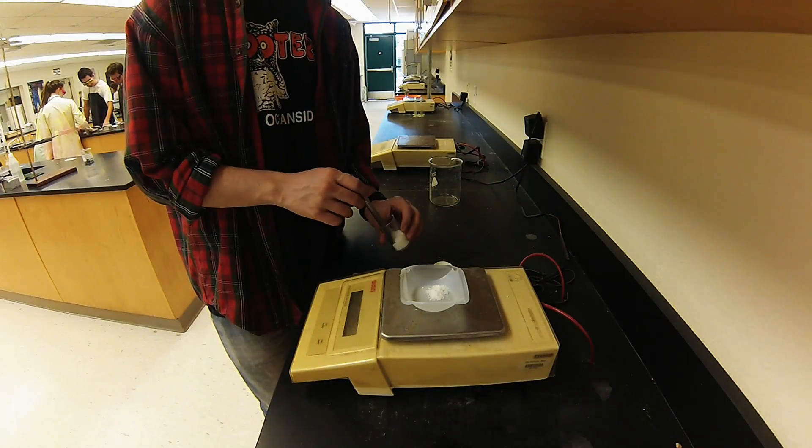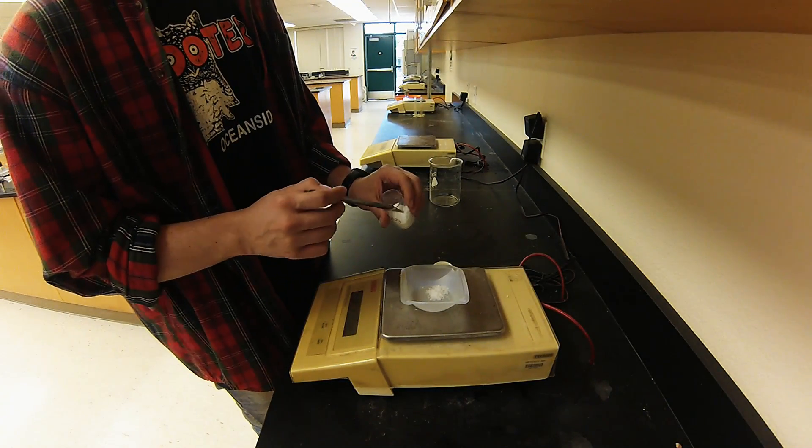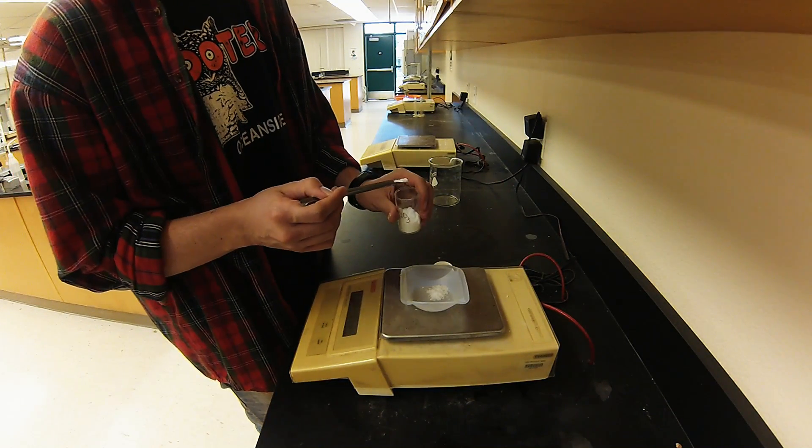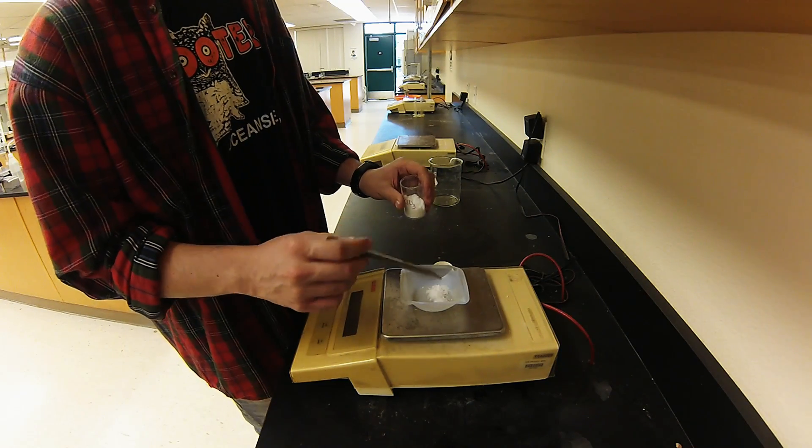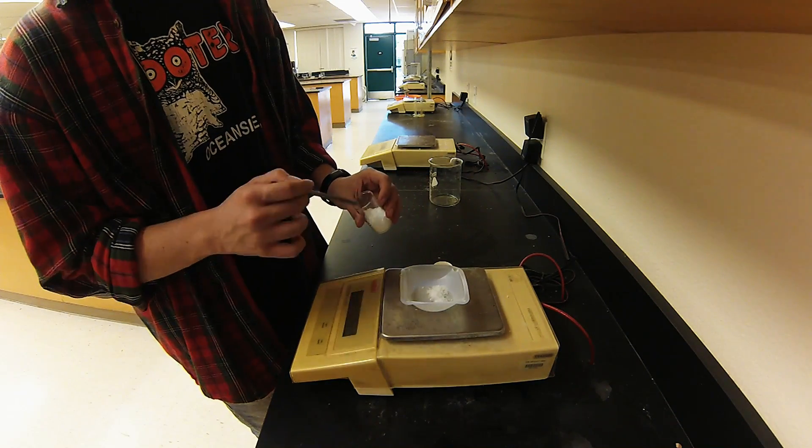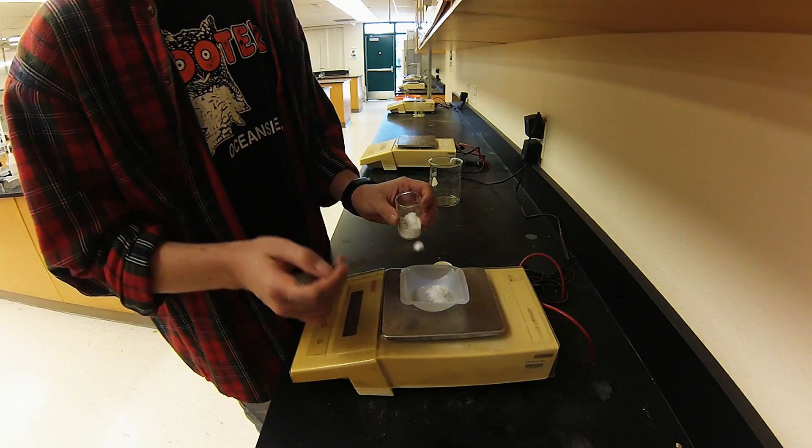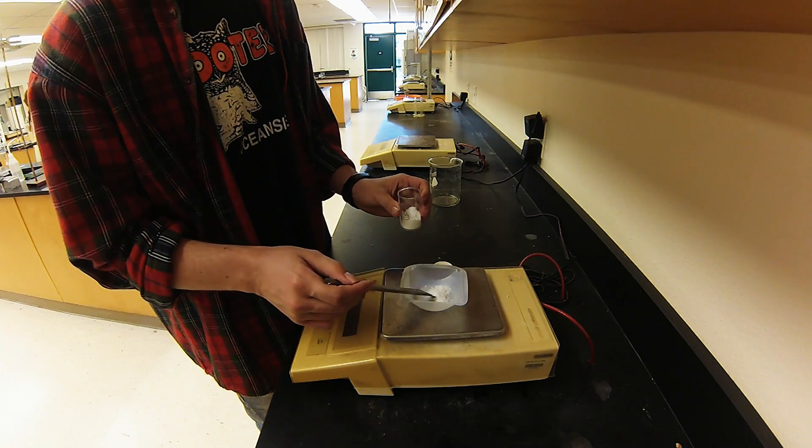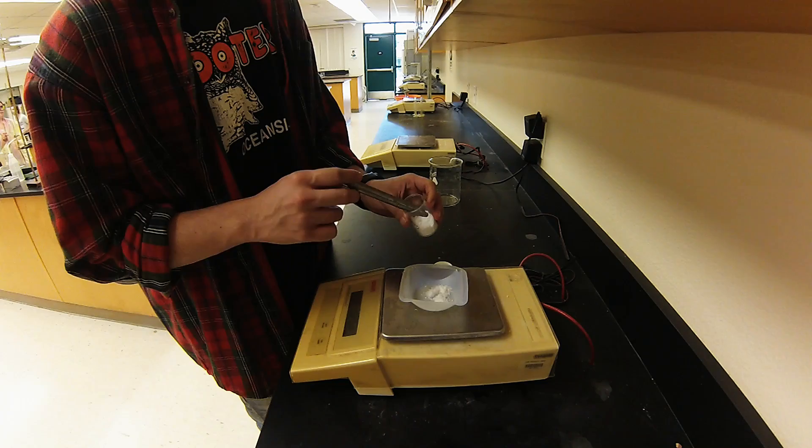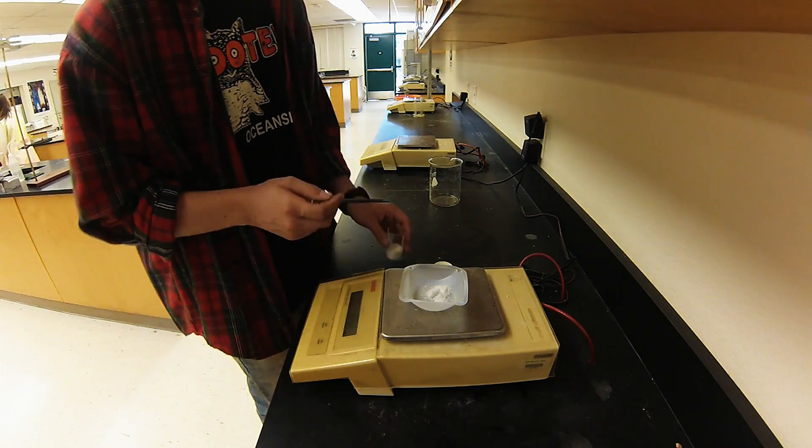First we're going to weigh out about two grams of the potassium chlorate into our scale, and be careful not to let the potassium chlorate touch the paper or your skin because it's quite reactive.